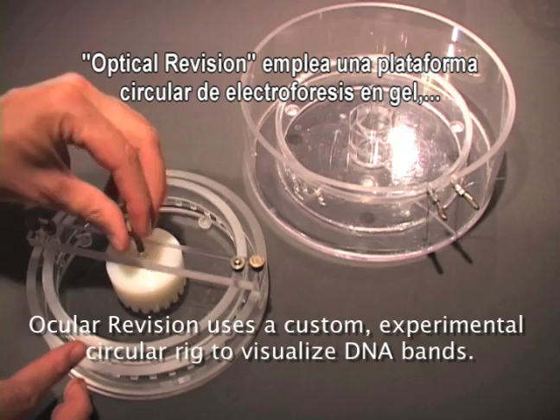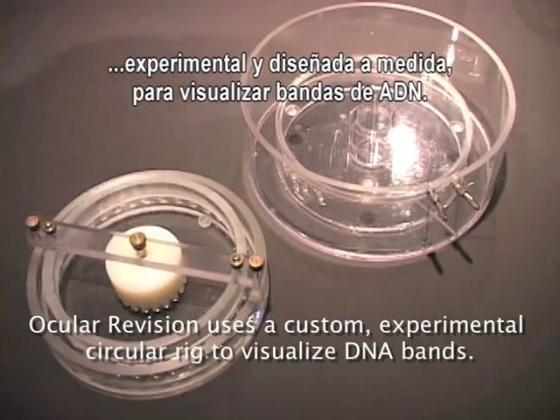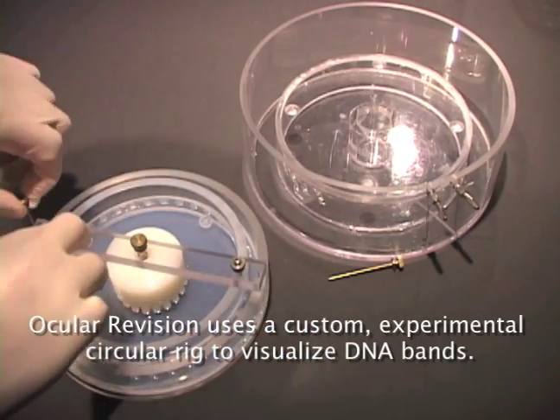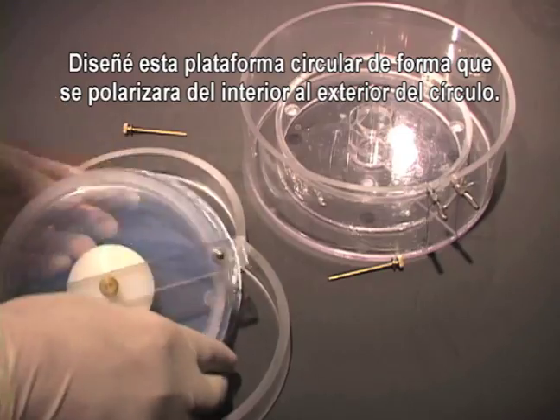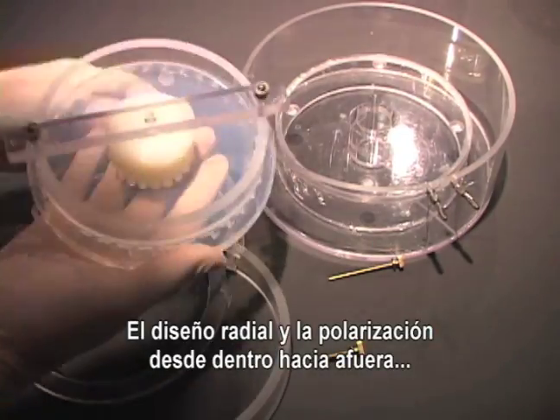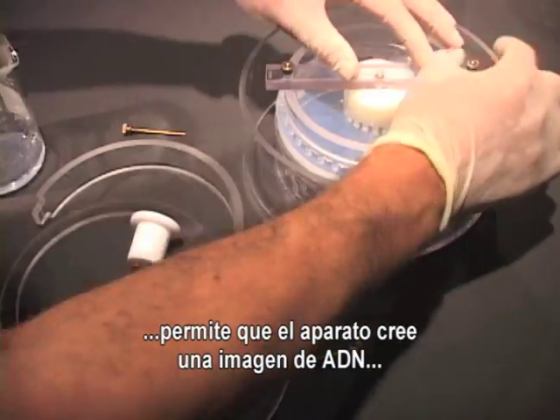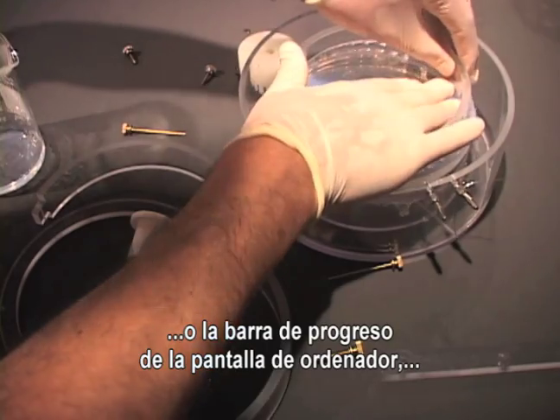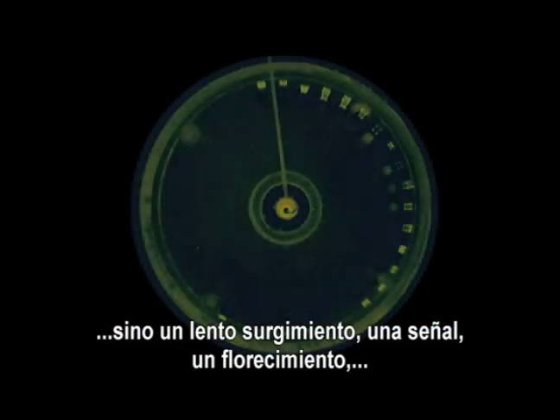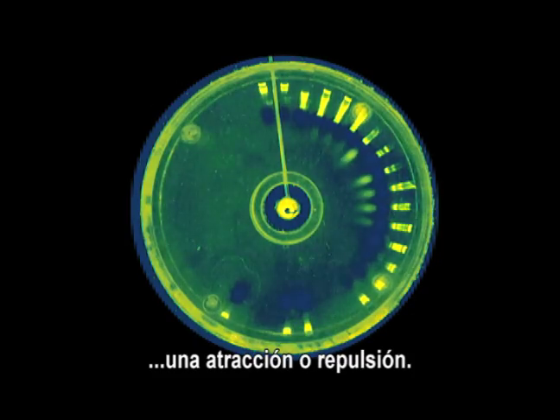Ocular Revision uses a custom experimental circular gel electrophoresis rig to visualize DNA bands. This circular rig was designed to be polarized from inside to outside of the circle. The radial design and the inside-out polarization allows the apparatus to create a DNA image reminiscent not of a bar chart or a progress bar on a computer screen, but rather a slow emergence, a signal, a flowering, an attraction or repulsion.